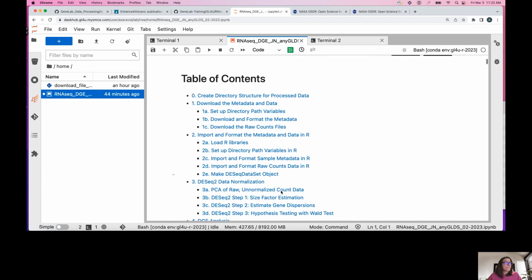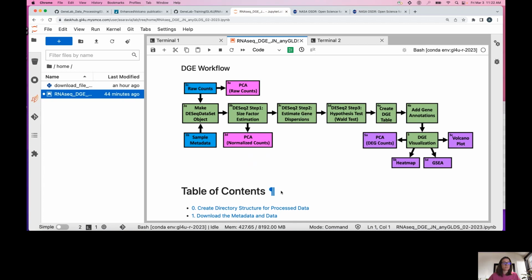So the gene results file only has raw counts, right? It doesn't have the annotated file. So annotation happened at 4B, does that mean we need to upload the library? We actually will pull in a table that we create now.